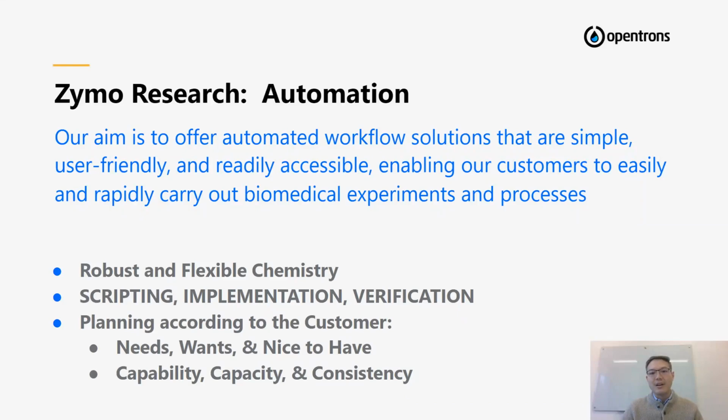So our aim as part of the Zymo Research Automation team is to create something simple, user-friendly, and readily accessible for customers to easily carry out their experimentation on an instrument. In this case, for Carlos and his class, they've started working with OpenTrons OT-2s.